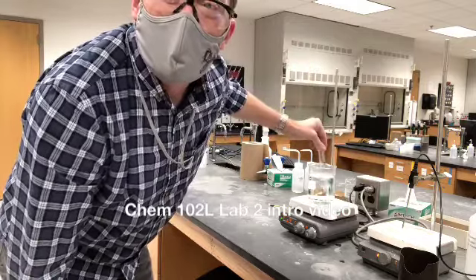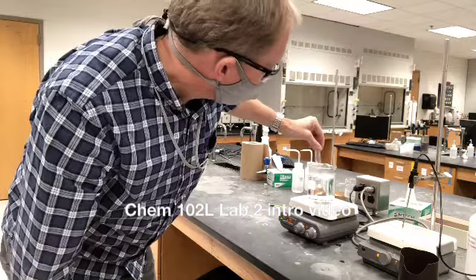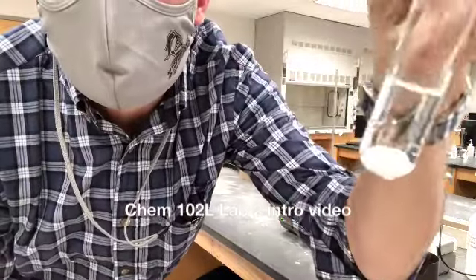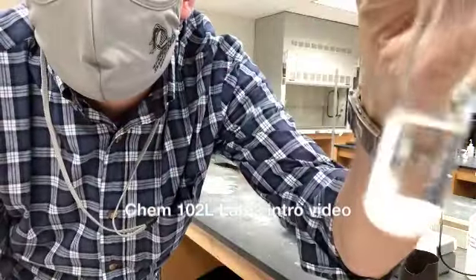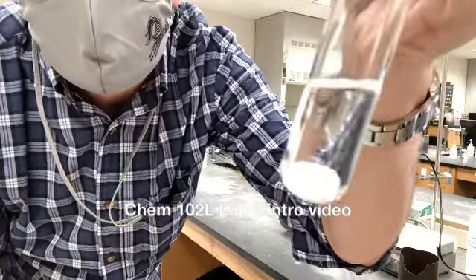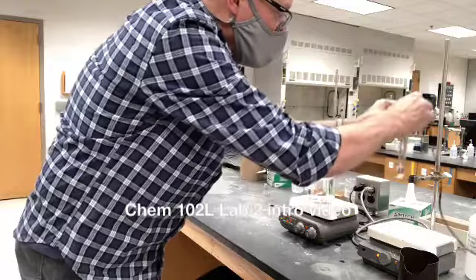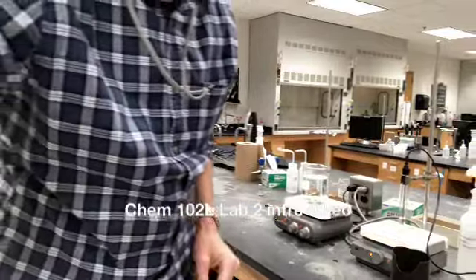So this is the process. We're making this solution. The next step is just to find its freezing point, and now we're completely dissolved. So I'm not sure that your camera is going to convince you that we have completely dissolved this because it's got liquid on the outside, but I've dried it off, and you can see that it's perfectly clear. So that's completely dissolved. We will take our thermometer and slip it down the center of that, and that's what we want to find the new freezing point for.